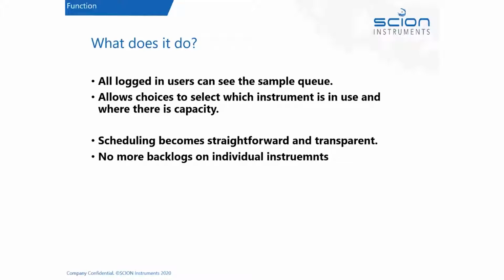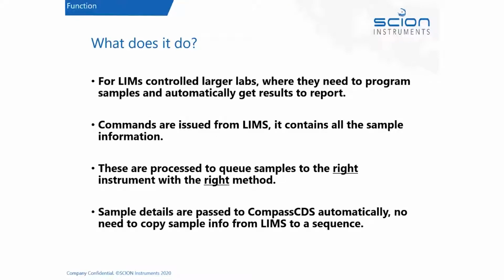Where it really comes into its own is when you use it in conjunction with a LIMS system in perhaps a larger laboratory. In the larger laboratory, keeping track of all of the samples is a major task all on its own. You have hundreds of samples delivered every day. Each of those are logged into the LIMS system so they can be tracked and determine which tests are going to be done on them.